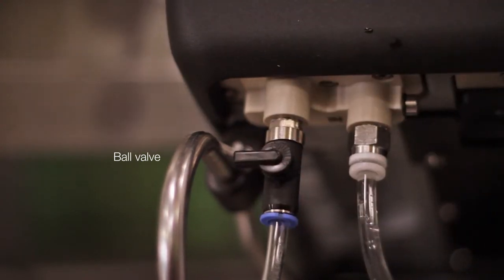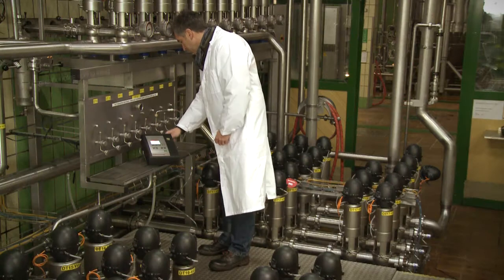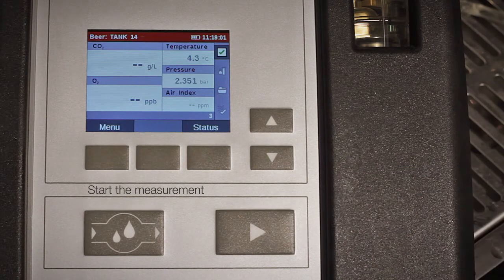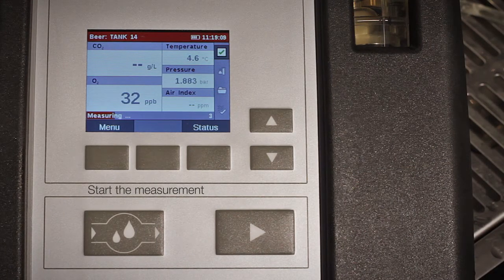Close the ball valve at the sample outlet and make sure that the measuring chamber is free of bubbles. Without stopping the rinsing process, press the START key in order to initiate the measurement.